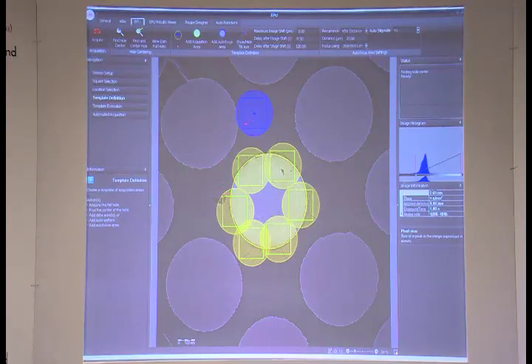Here we have like a focus spot where we can do our focusing on, but that is all done by the machine. The machine uses some beam tilting procedures to automatically get focus, and then we can set the focus to what we wish.